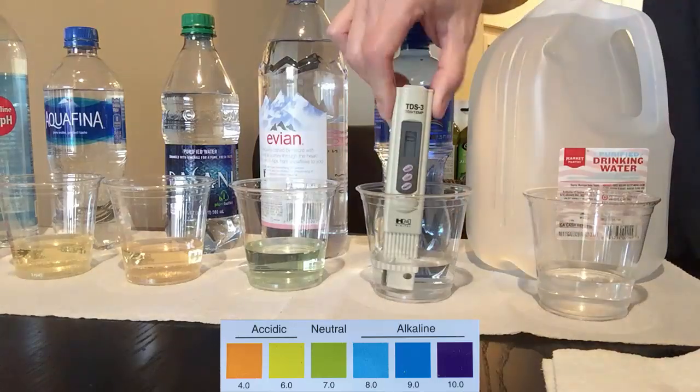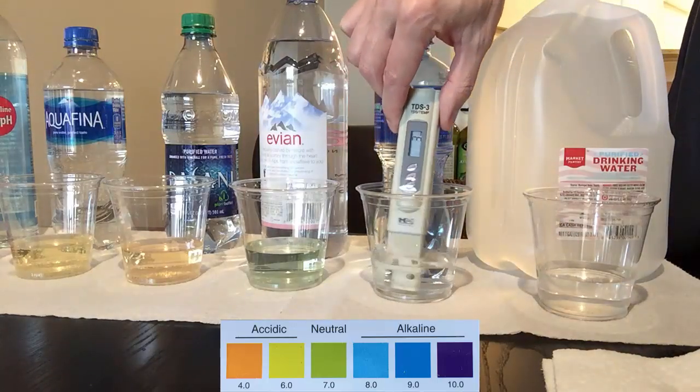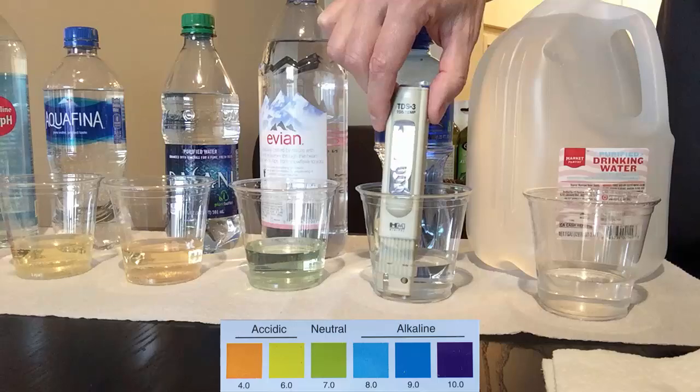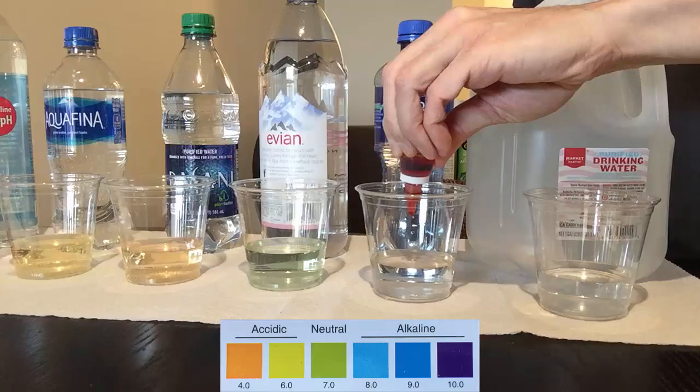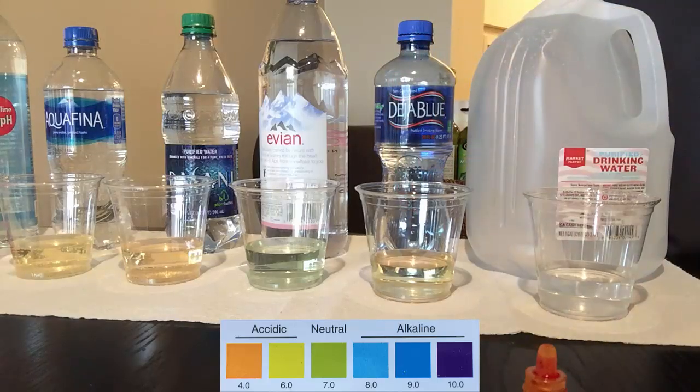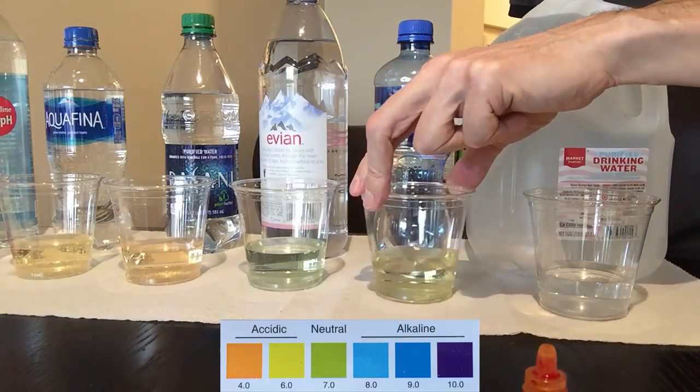Deja Blue is a product of Dr. Pepper 7-Up Inc. This water has been purified through reverse osmosis, as a TDS level of only 3 points indicates, which also means this water will be acidic at about 6 pH.